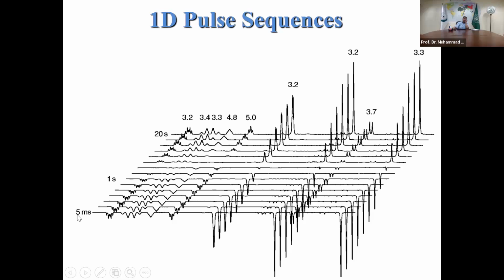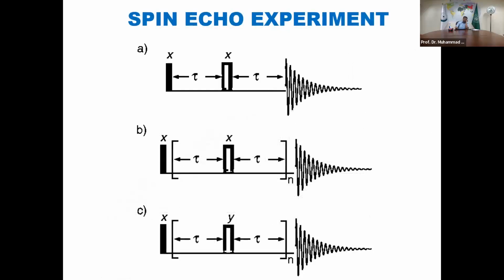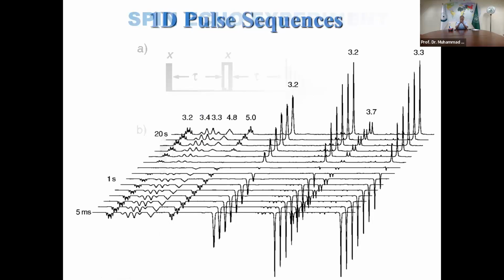The most important is this dimension for you. And this is the experiment which you need to understand to the core, because this is what eventually is the basis of multi-pulse NMR spectrum. It's called inversion recovery method. And this is recorded, and often it is performed in order to calibrate the NMR spectrometer.